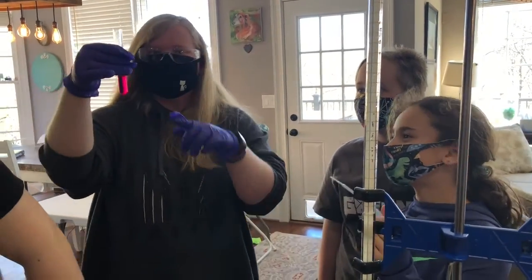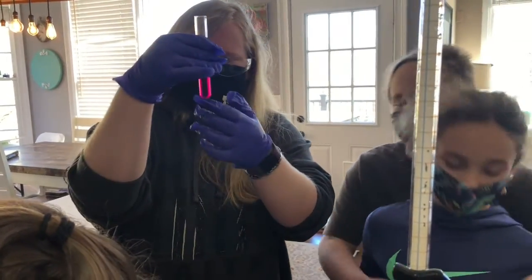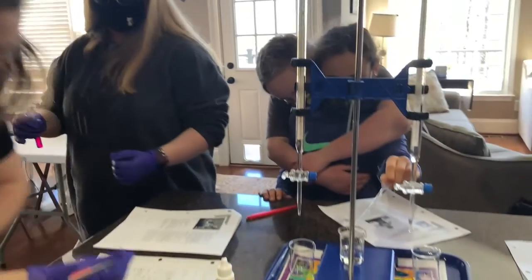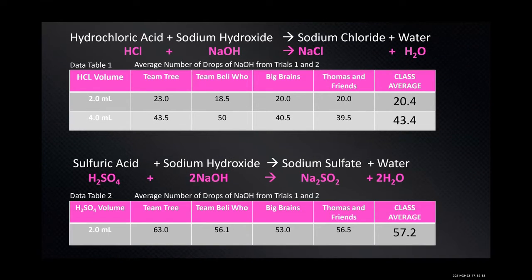Oh wait, there's a bubble on top and then pink on top and clear in the bottom. Oh, cool. Yeah, that's done. Okay, good job, guys. Put it down. So this time we needed 57.2 drops.